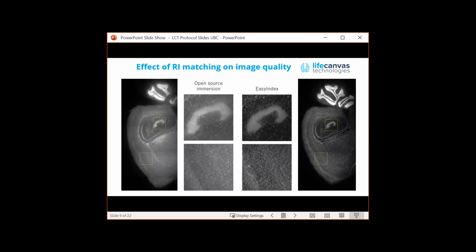This is a refractive index matching solution that makes the tissue fully transparent after removing the lipid membranes. It has been developed to be optimal with our entire setup. You can see in these pictures that index matching is still important after removing lipid membranes, because any refractive index mismatch, especially when you go deeper into the sample, can cause blurriness.